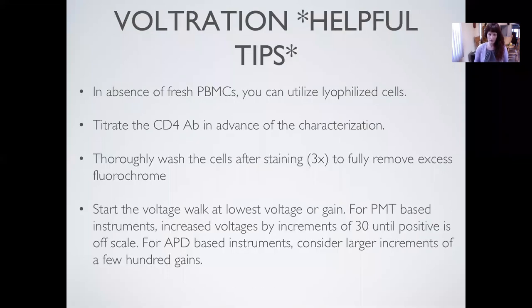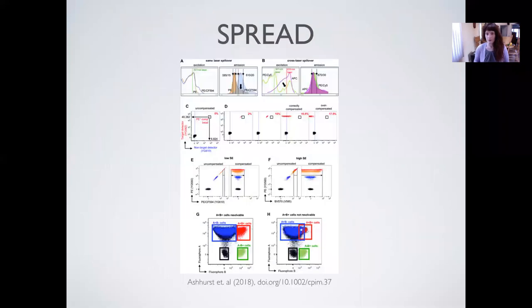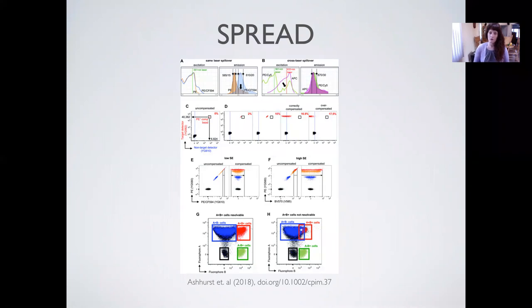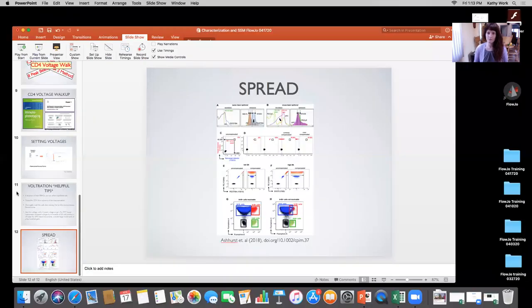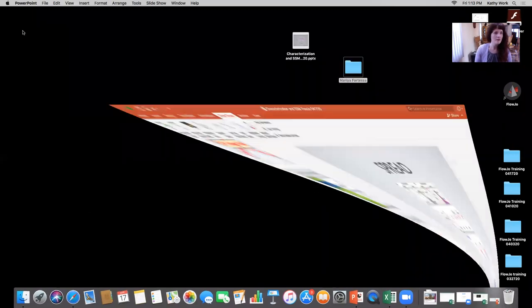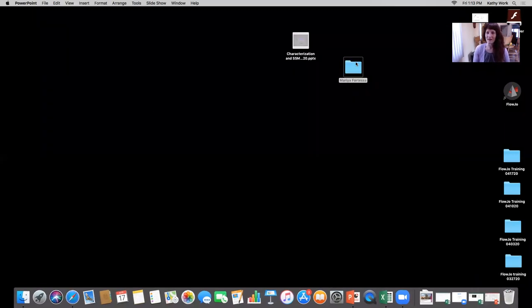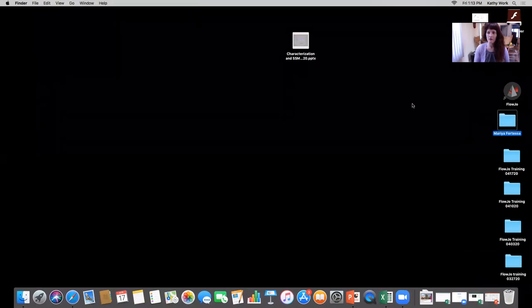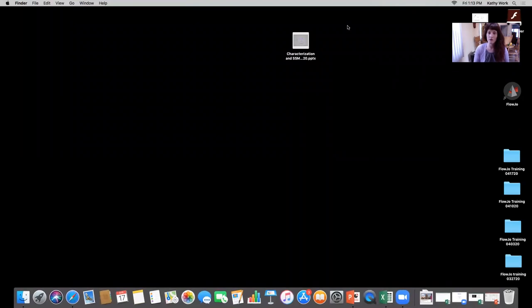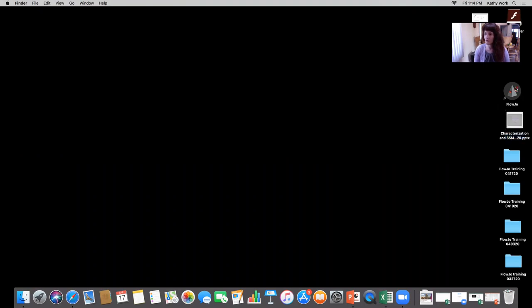After we go through the instrument characterization, we're going to discuss the spillover spread and how that impacts panel design — how we can use that to better design panels. Those are our introductory slides. If you have any specific questions as we go along, Rui will absolutely interrupt me and ask those questions or answer them. So I'm going to open up FlowJo.